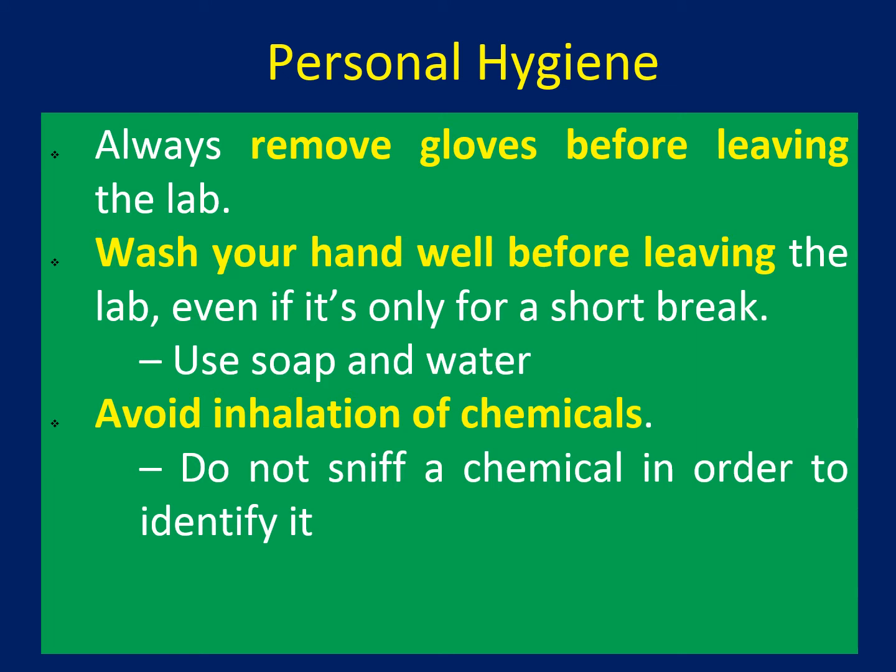The personal hygiene things you have to do while you are working in the lab. There are many things, like you always need to remove the gloves before you are leaving the lab, because you may get contaminated with some toxic material. While you are going out of the lab, you can remove those gloves, because if somebody who is not working inside the labs comes into the lab and touches the door handle, they may get contaminated with those chemicals. Don't inhale the chemicals by yourself, because there may be some toxic chemicals as well.